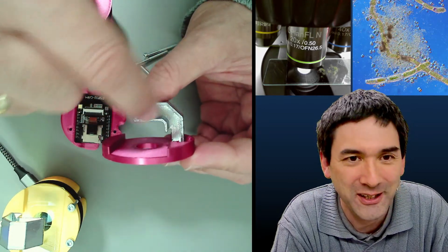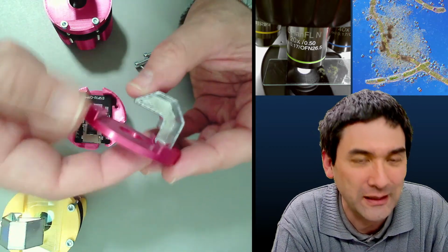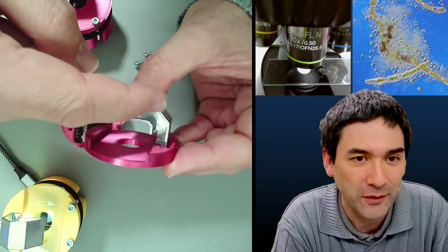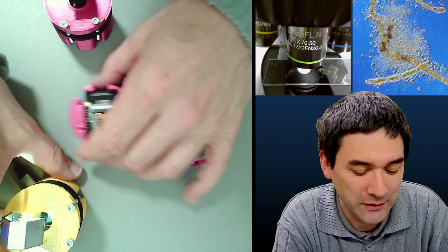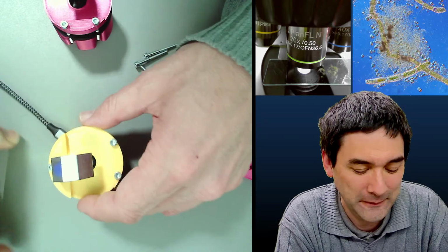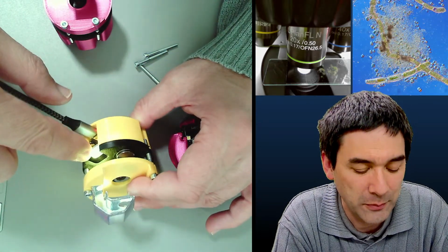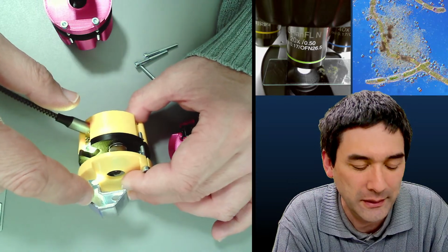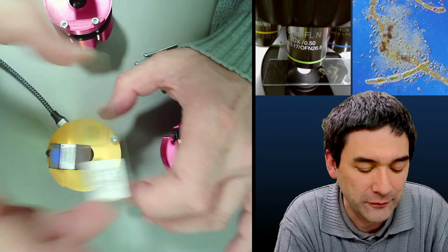So that's a very simple but effective way of solving the problem. Even though the light comes from the bottom, it's redirected down here. Maybe you see it over here a little bit better. What you see is that the light from the bottom goes all the way up, and then bounces around and goes down again to illuminate the sample from the top.